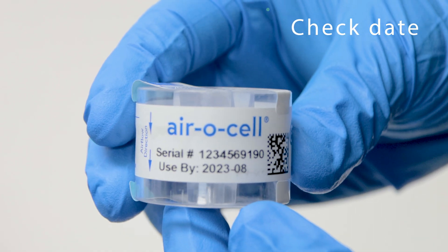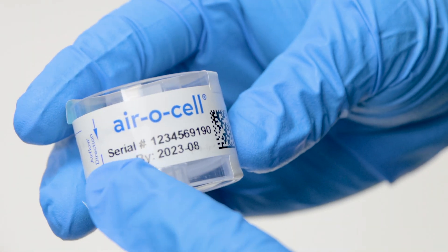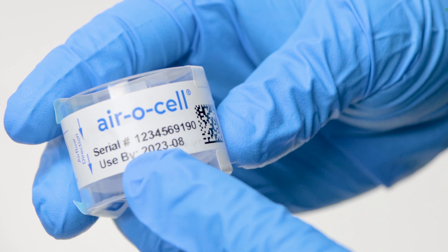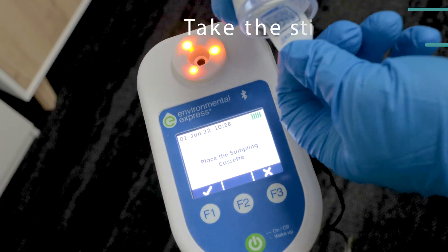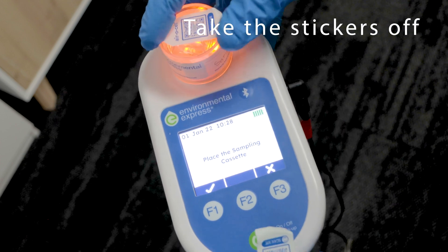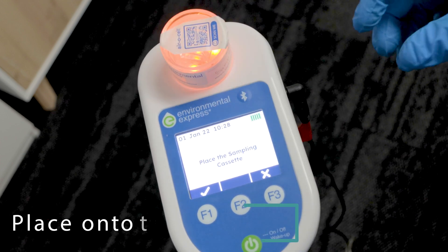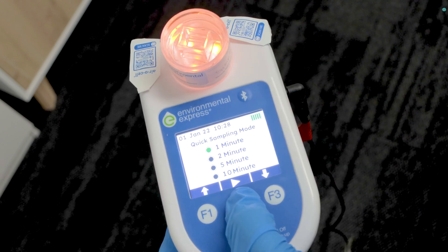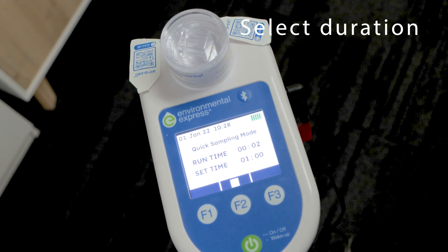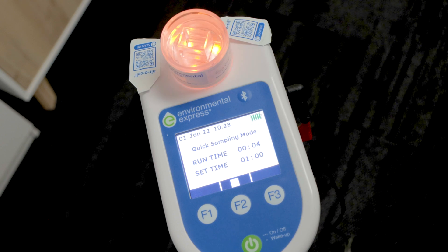When making a sample, first check to see if your cassette is in date. Note down the cassette serial on the chain of custody to keep track. Take the stickers off the cassette and place it onto the pump. Be sure to place the cassette onto the unit with the airflow indicator facing towards the pump.